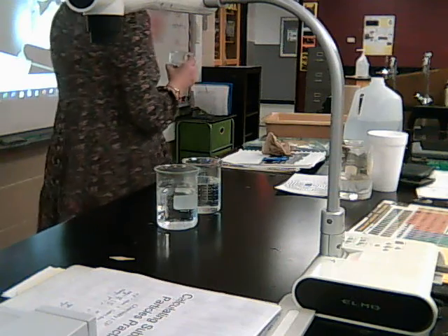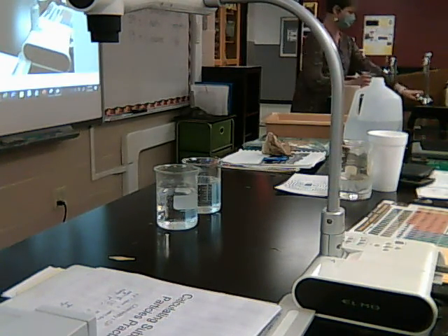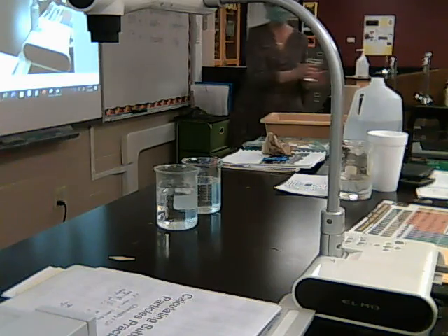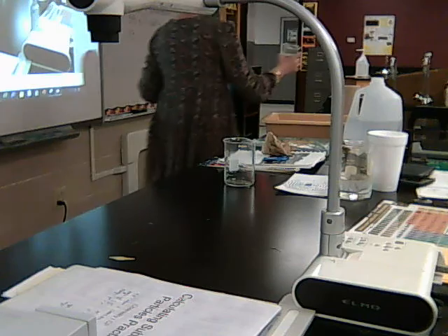So what we just found out here is how to do an experiment incorrectly, okay? Now, there are some things that I did right, but there's some things that I did wrong, too. So we're going to try again. Hopefully we'll have time without all the mistakes.